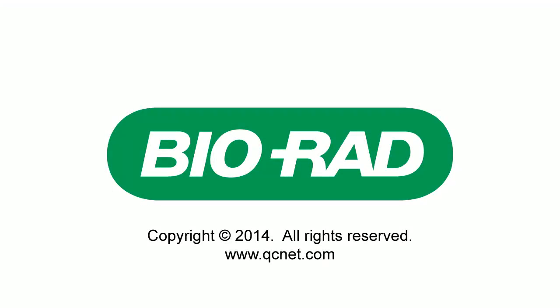Now that we've covered some broad topics that are applicable throughout the software, let's look at UnityConnect 2.0 in action. Continue your training by viewing Part 4.